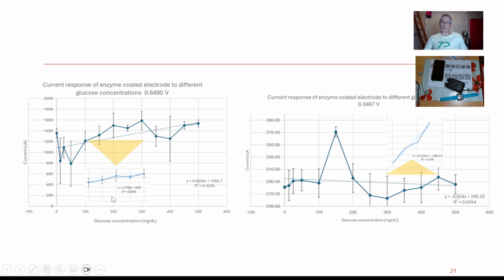So I get that what we're looking at here is signal, call it current, versus concentration, same here as well. I get the point that you're talking about current versus concentration, but your current is really high. It could be linked to the surface area of your electrode, but I got it. And if your current really is that high, I'm not sure that the potentiostat that you've got is able to really apply the compliance voltage that you would need to support this current. So I'm super suspicious that you're really seeing anything here.